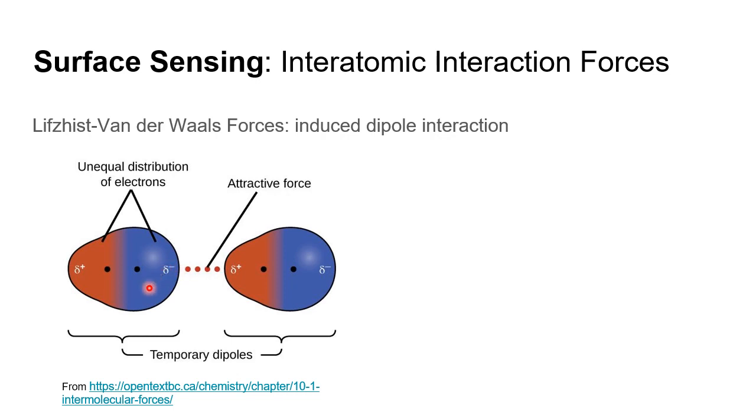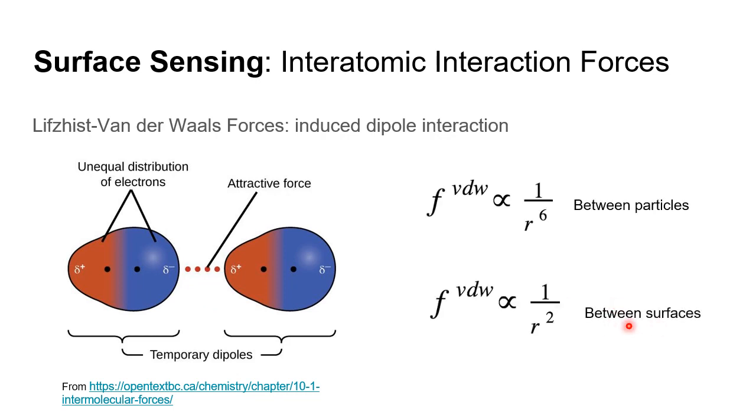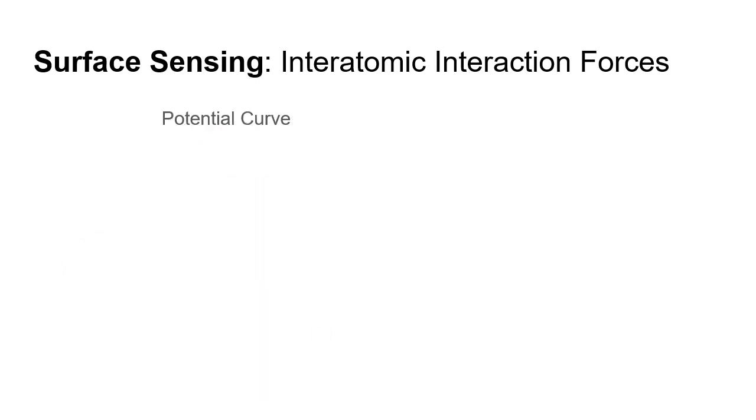The localization changes position in time, so the attraction is dispersed around the entire bulk of the material. In the case of our interest, this interaction between surfaces is proportional to the inverse of the distance squared between the surfaces, and it scales up to 100 nanometers.